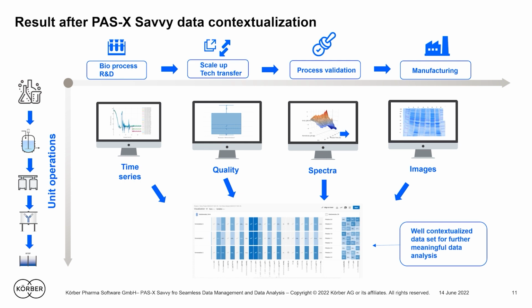That means you have to think how to link in one part of the time series, so the first part which you may see here, how to link this one in the upstream part in the development to a spectrum in the downstream in manufacturing. So you see, it's not about linking, just putting these things together. It's about contextualization, and contextualization needs domain knowledge.